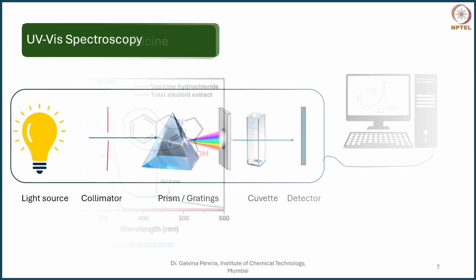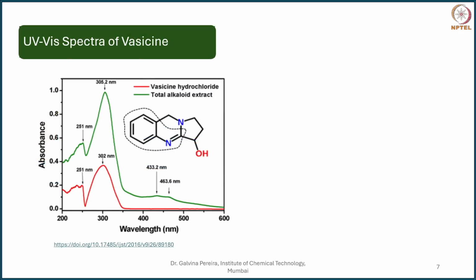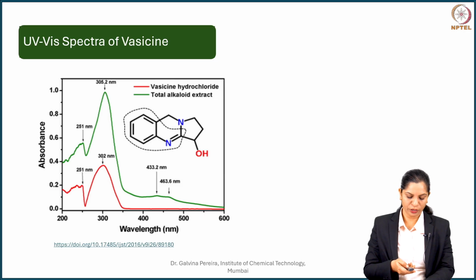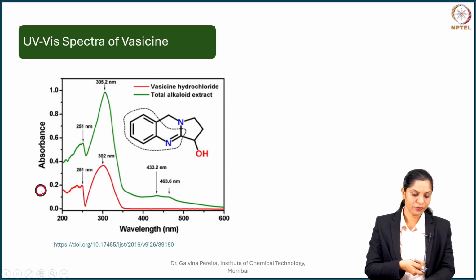So you can see here, in case of your alkaloids, if I just take that sample, put it in the quartz glass tube and run the UV, you can see this UV runs at different wavelengths. I have kept a range, or more specifically a scan, starting from 200 nanometers. It is scanning the absorbance, how much light it is absorbing, at all the wavelengths till 600 nanometers.